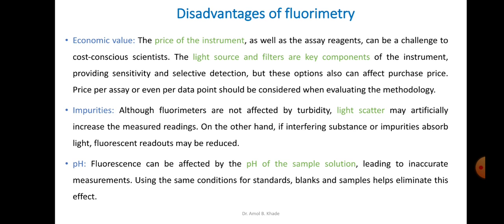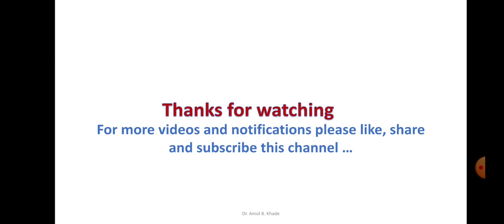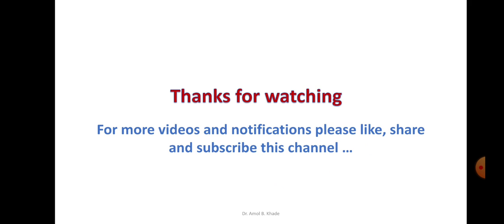We can overcome these drawbacks, and with that, fluorescence spectroscopy, we can use it to a great extent. It has already been used to a great extent in the industries, especially the biopharmaceutical industries, and even for various drugs and other fields. So that is all about the applications of fluorescence spectroscopy and how we can decide on fluorescence spectroscopy over UV visible spectroscopy.